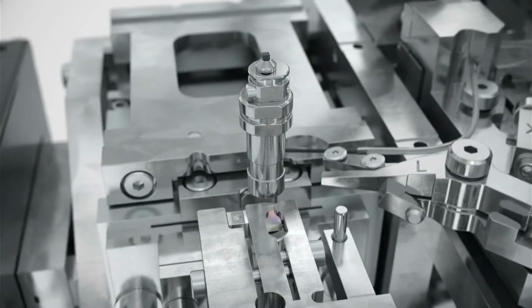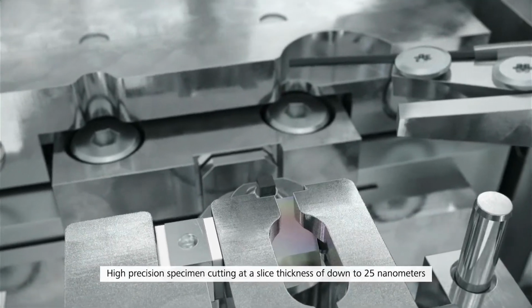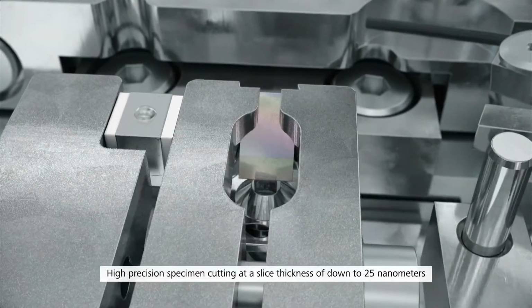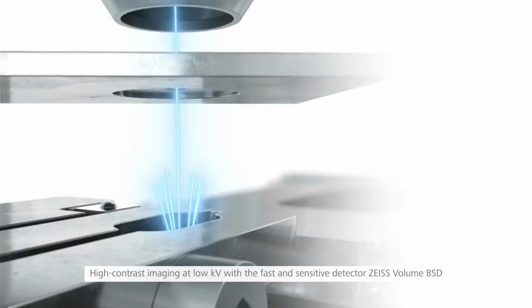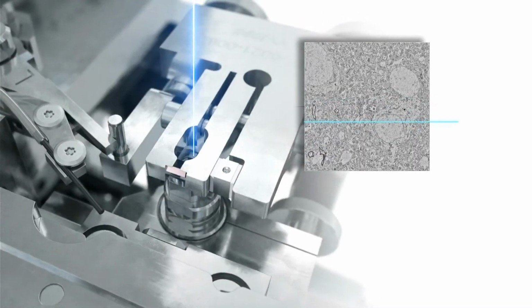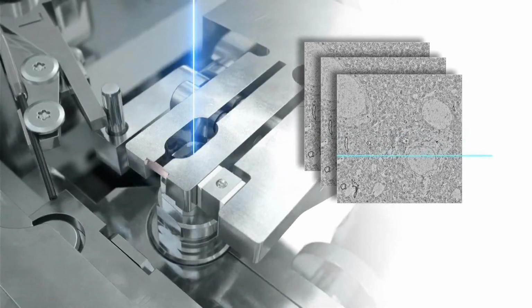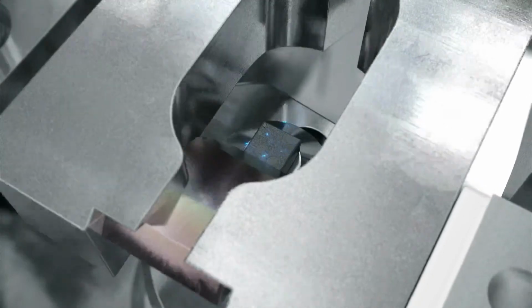This is the sample holder, which goes down here. Here we see the diamond knife. The sample thickness that we can cut is 25 nanometers, and then it's a completely automated system. Here there is also a special new detector for low voltage, also low kV imaging, in a range between 1 and 2 kV. This is typically what we use for these kinds of samples.